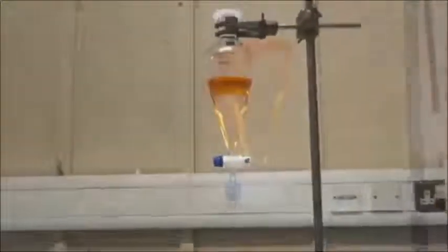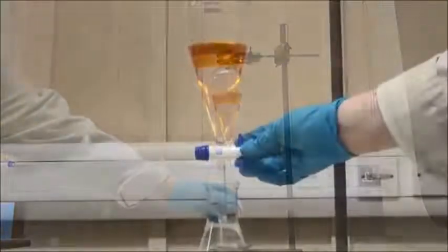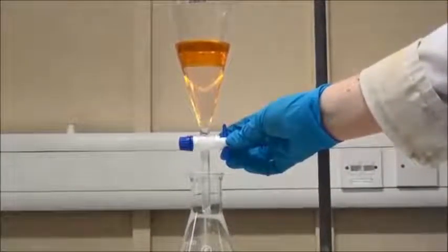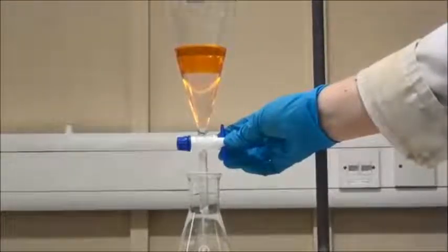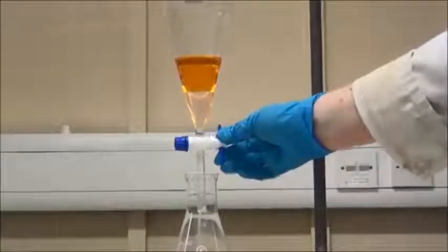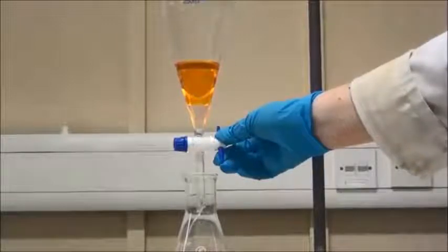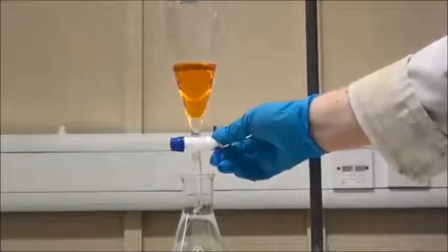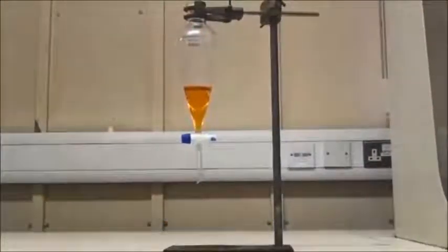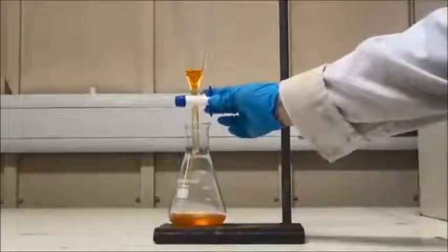Now it is time to extract the layers. Always start by removing the stopper from the top of the funnel. Open the tap and drain the first layer into a clean conical flask. Make sure you start to close the tap as the bottom layer drains out to slow the rate of flow and to help you correctly close the tap when you can no longer see the separation between the two layers. Put this conical flask to one side and collect the remaining layer into a new clean conical flask.